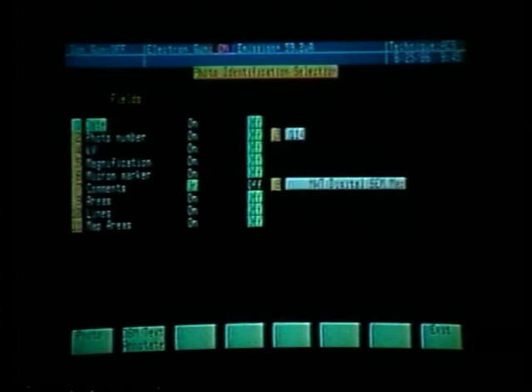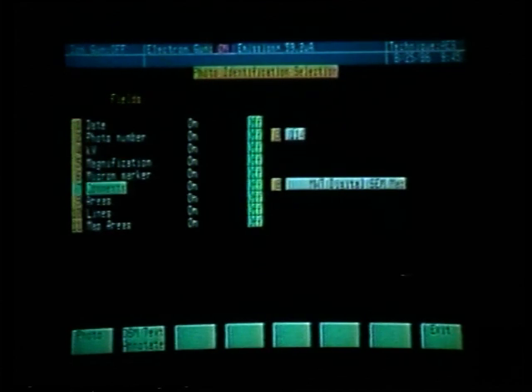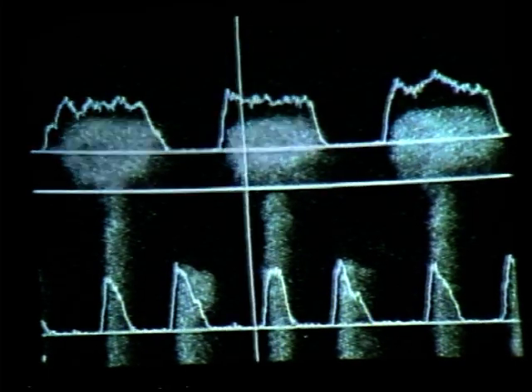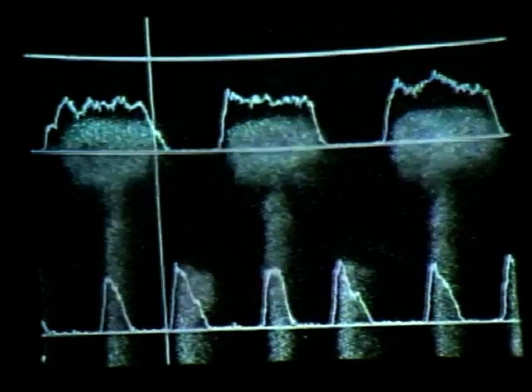We no longer have the MWT digital SEM map, so let's toggle our comments off using function key number 7, toggling to off. But still, we would like to annotate, soft key number 2. We then see on the TV monitor, once again, cursor, locate where we would like to annotate.